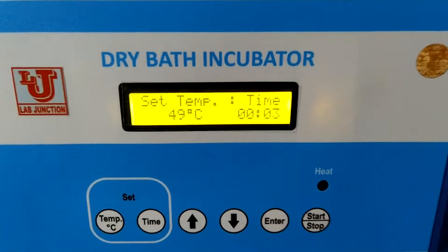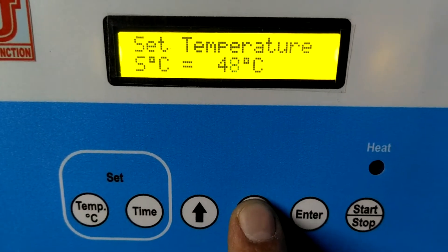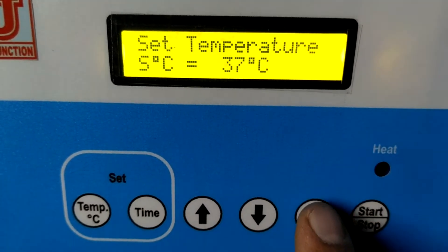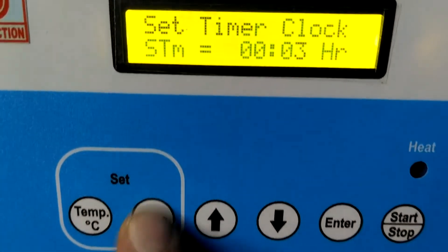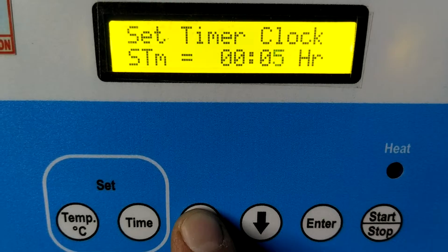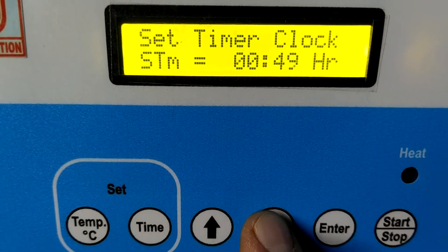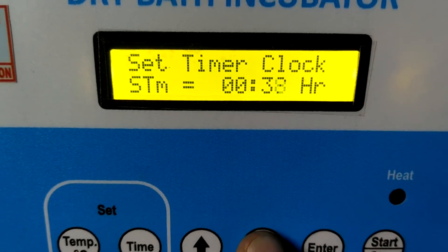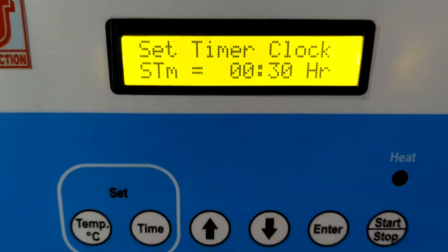First, you have to set the temperature. For example, I am setting the temperature to 37 degrees. Press Enter. Then you have to set the time. I am setting half an hour. After half an hour, press Enter.